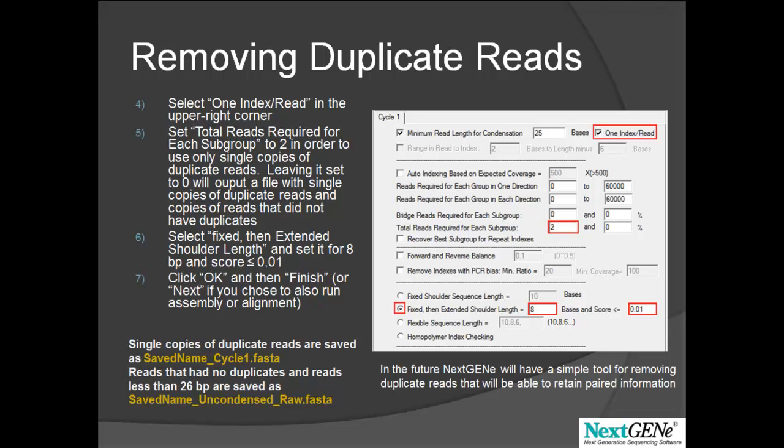In the future, NextGENe will have a standalone tool for removing duplicate reads that will be able to retain paired information.